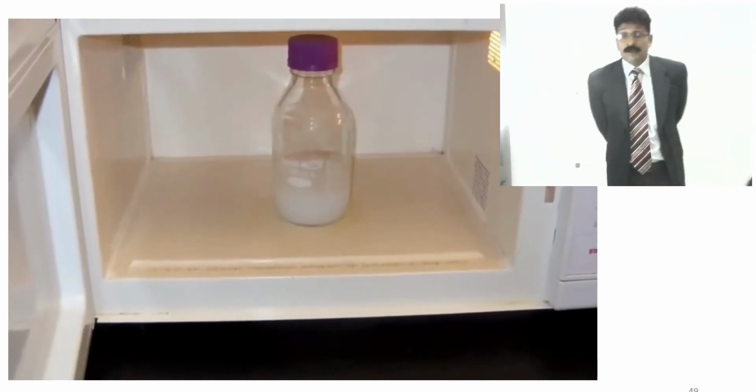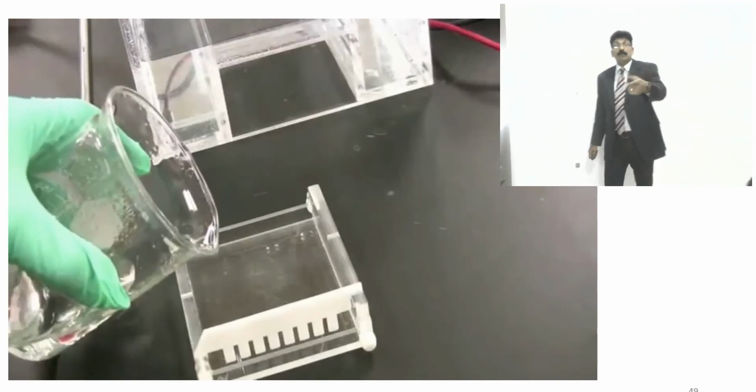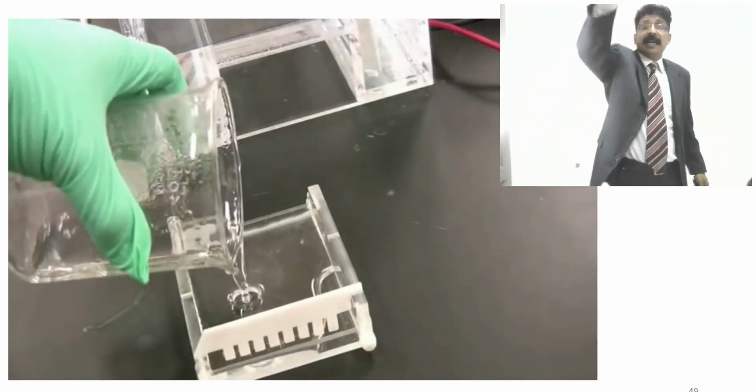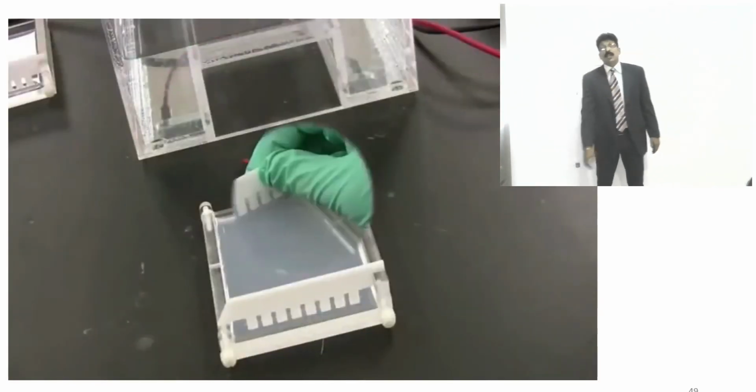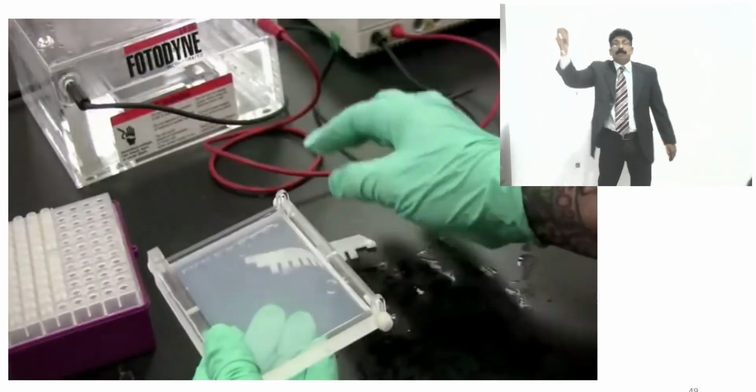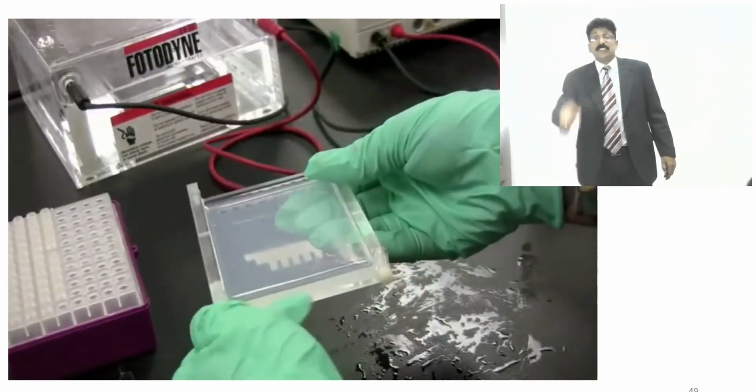And there will be a plate which contains a comb-like thing, that is a plastic, and the gel will be poured in a liquid state, and it is solidified. Now it is solidified. After solidifying, you take that plate, you will get all the wells. That is called the wells, where you have to keep the sample.